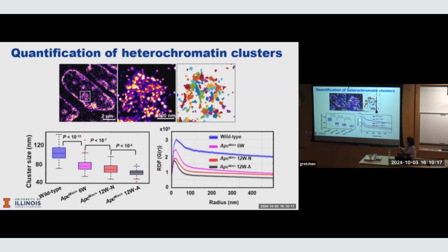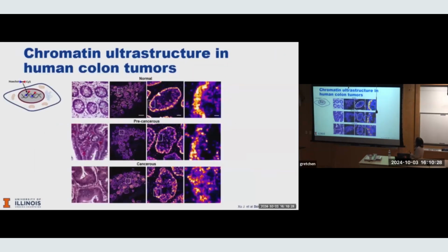So this is an antibody-based labeling. And every time you do fluorescence, biologists always ask you a bunch of questions, and you have to cross-validate. So we did this. They also wanted us to look at DNA. This work was motivated by the reviewer's question. We actually had to make our own dye that conjugates Cy5, which is typically used for single molecule localization, delivered to the nucleus. And that enabled us to do super resolution on the labeled DNA.